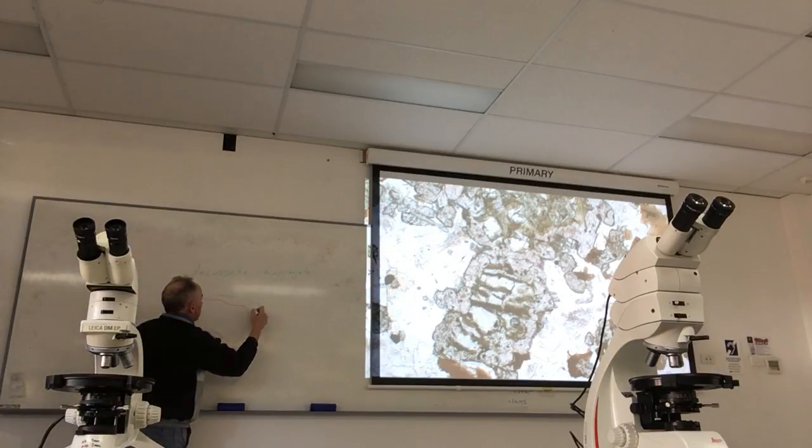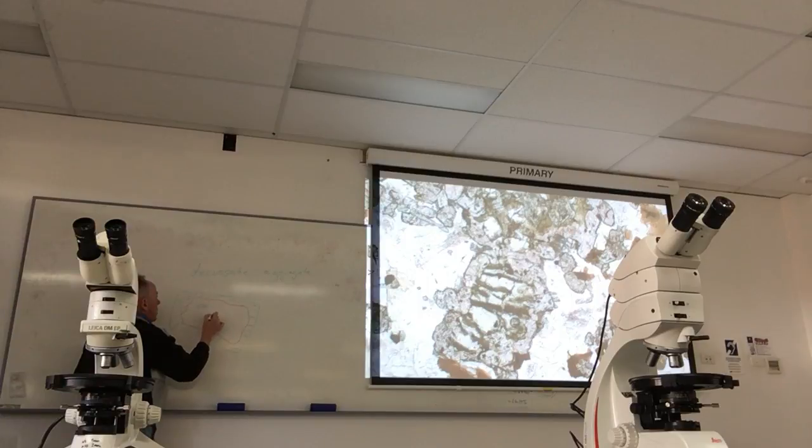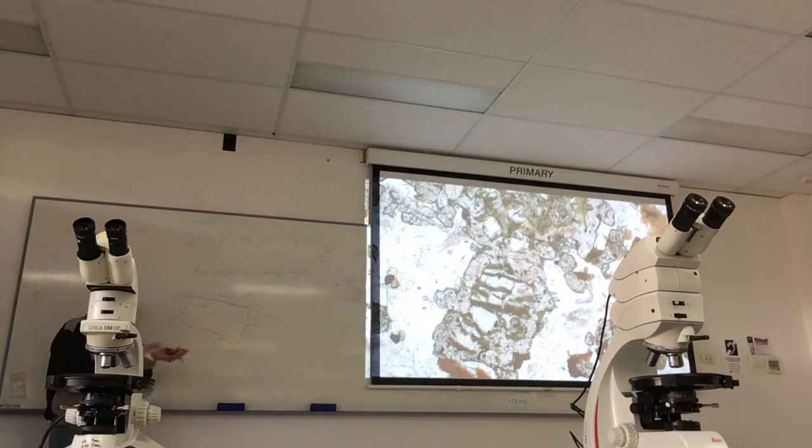Okay, and you'll see some grains like that on the side, and other grains you'll see hornblende inside the pyroxene, and you go, huh? How does that work? And that's the 2D, 3D problem. That happens when you just happen to have a section that's cut this way, and you're looking down from there, and what you're seeing is hornblende apparently completely surrounded by clinopyroxene.